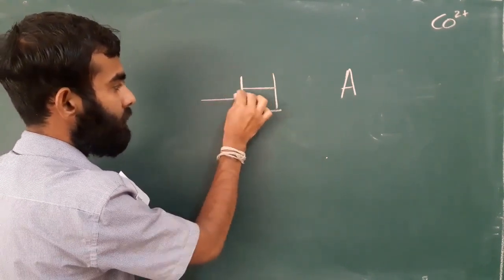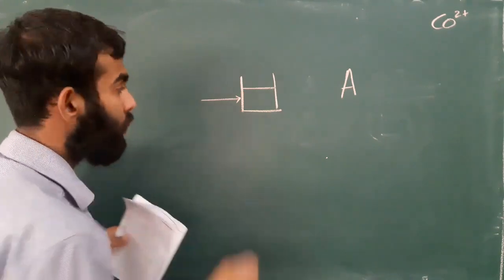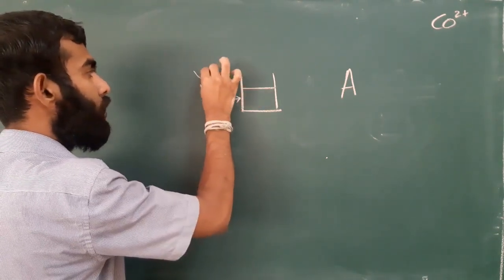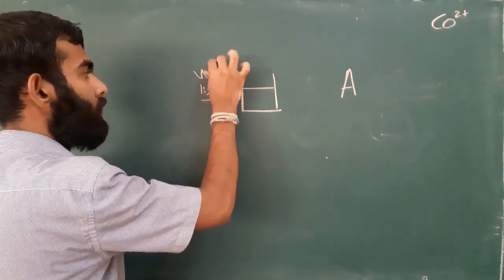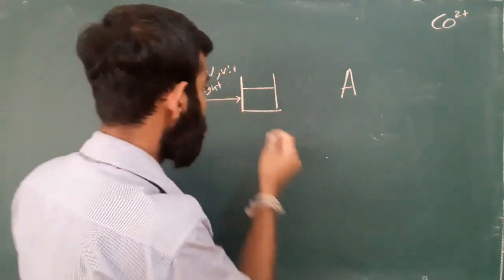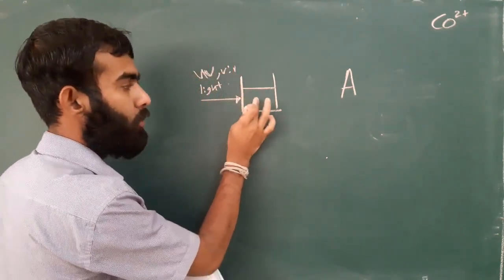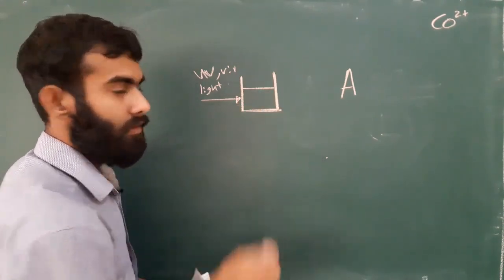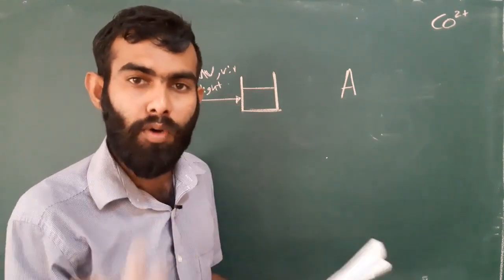introduce a particular radiation or light, UV or visible or IR or any radiation, into a particular solution which is in a vessel, some glass or quartz or anything.